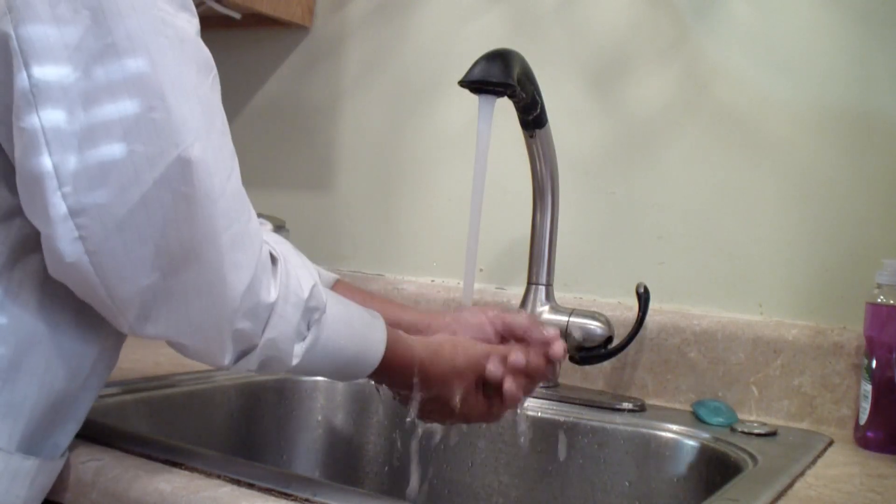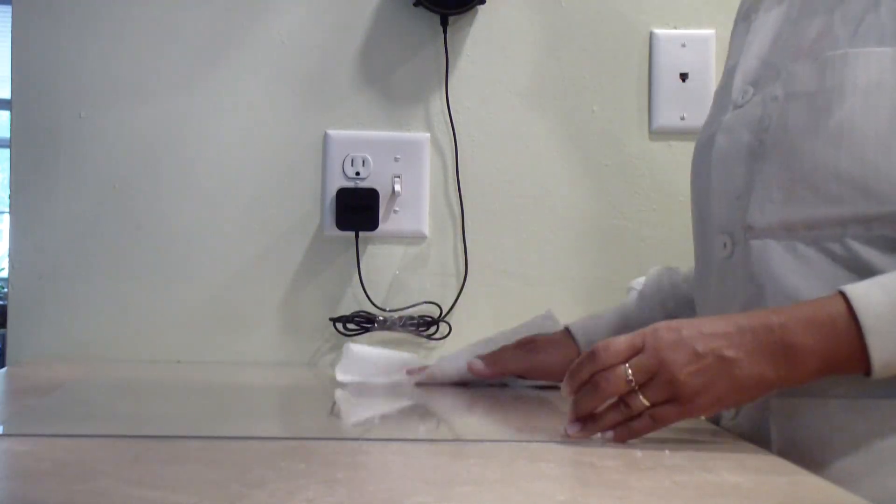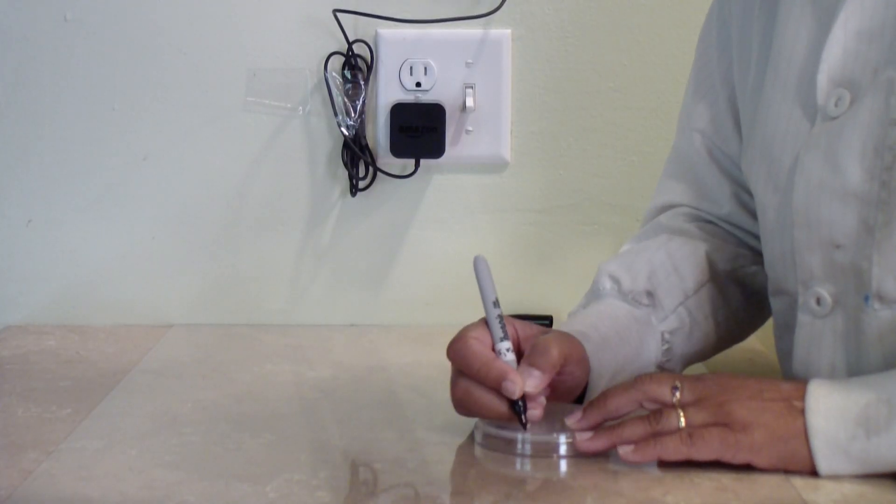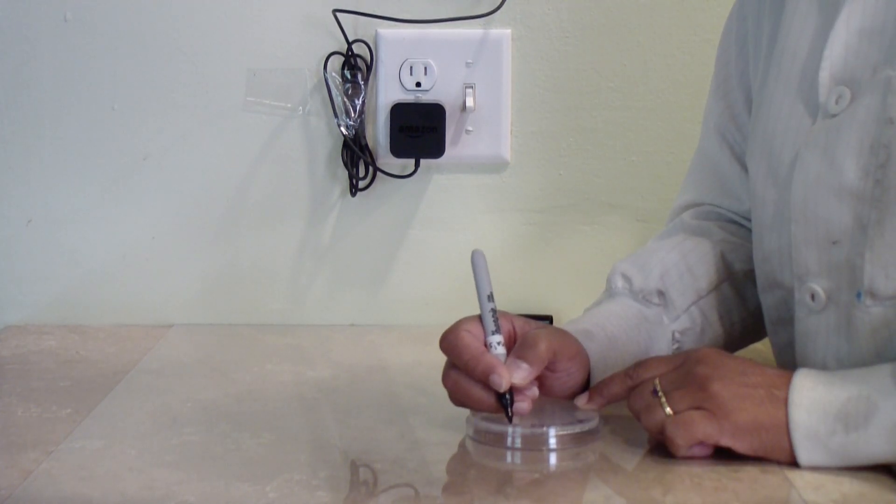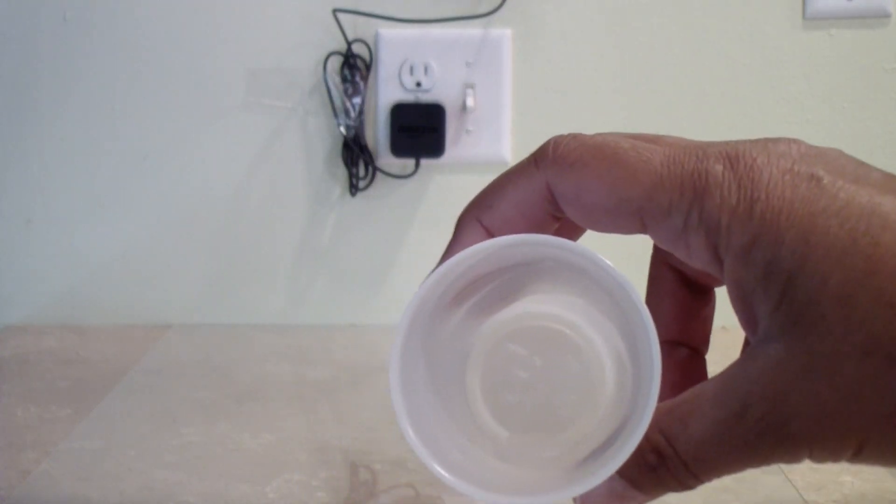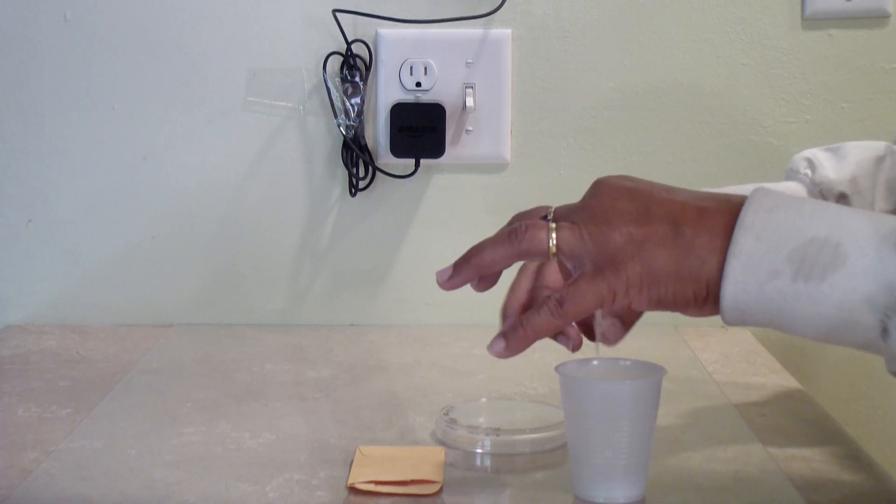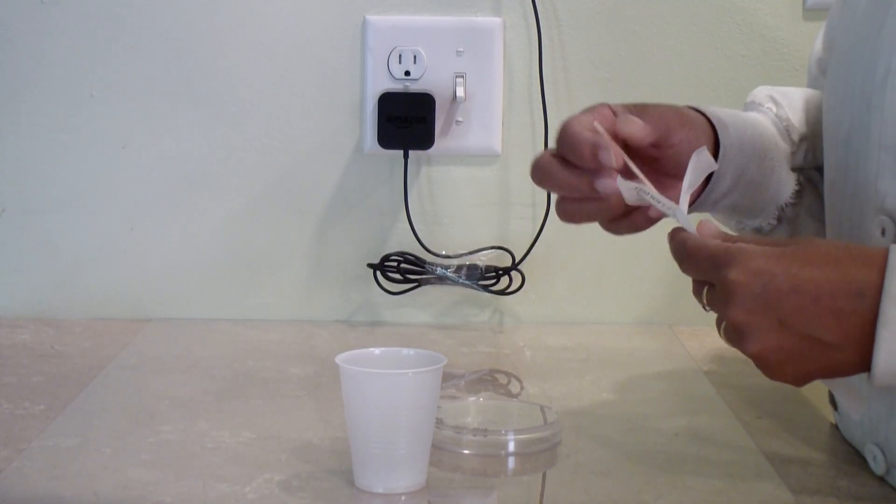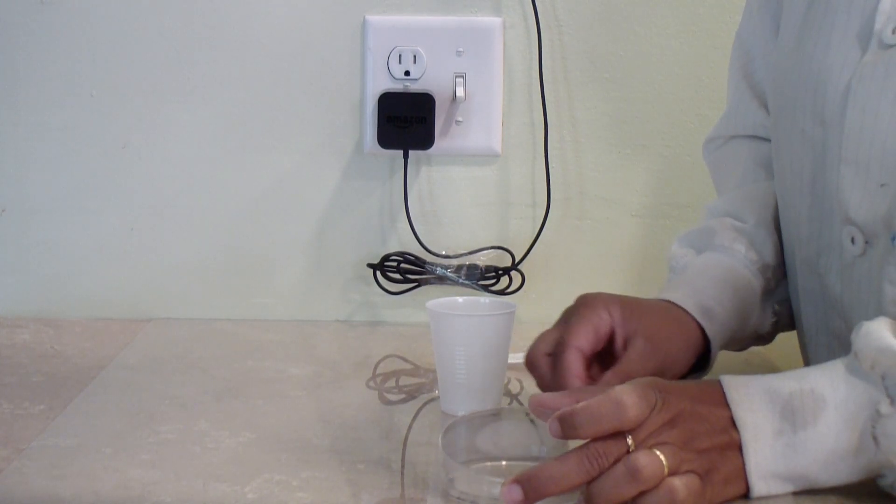As always, start by washing your hands and wiping down your work area with disinfectant. Turn the PDA plate upside down and label it as explained in a previous tutorial, then turn it right side up again. Add a few drops of water in a cup or a spoon, and mix a few yeast grains with the water. Dip a cotton swab in the mixture and open the lid of the plate just enough to gain access.